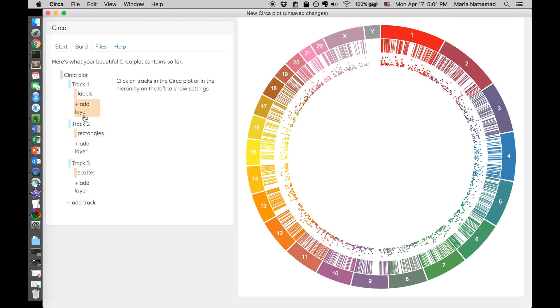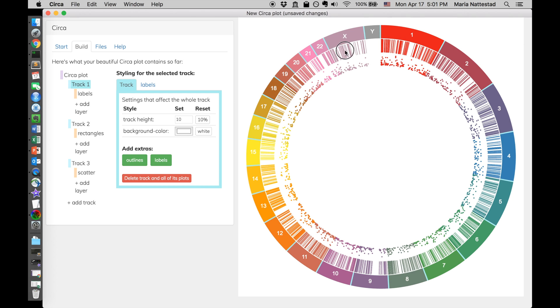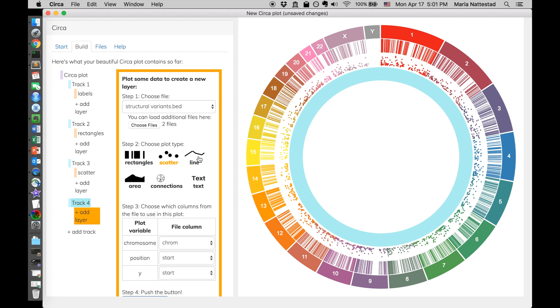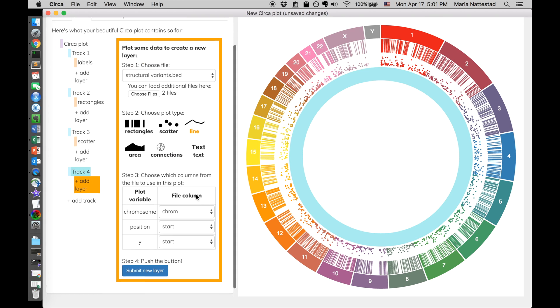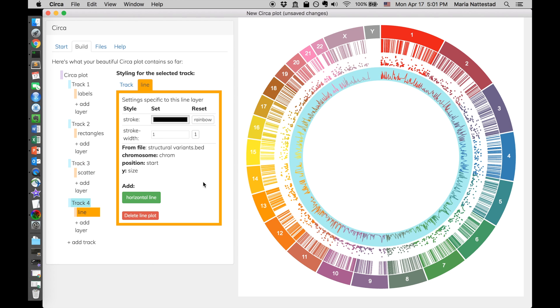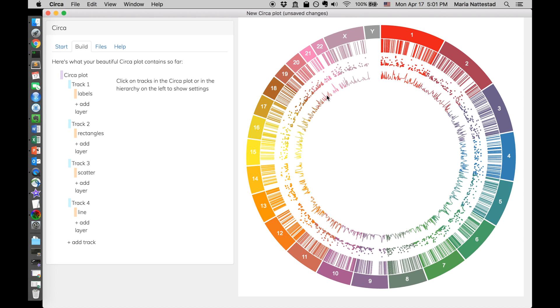Sweet. So now you can see we have a track with labels out here, one with rectangles, and one with a scatter plot. Let's keep going. We have structural variants, let's do a line plot, again, size is good. So that's the line plot.